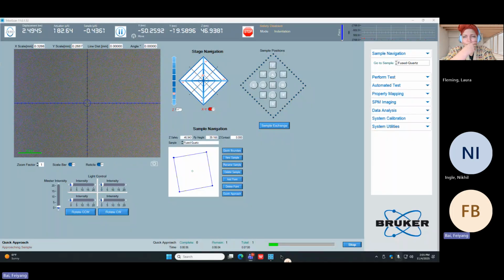Yeah, the internet is not real stable. Sometimes I have to use cellular data to keep it. Thank you for doing so. Yeah, I know it's a lot. It happens pretty often where it's hard or impossible to get internet to the instrument. I'm glad you were able to, though, so that we could do this remote training. That's better than not.